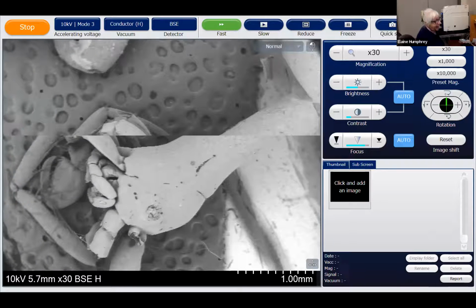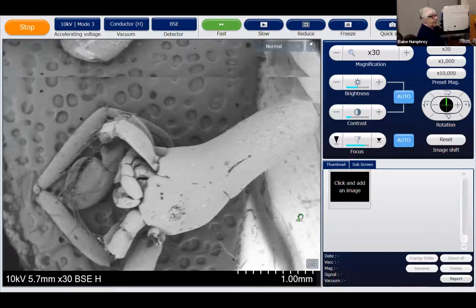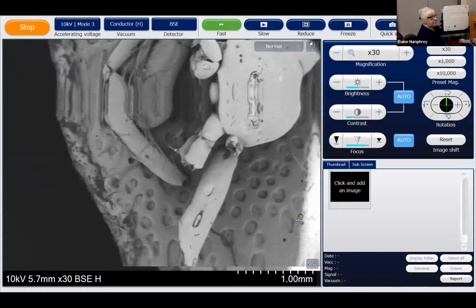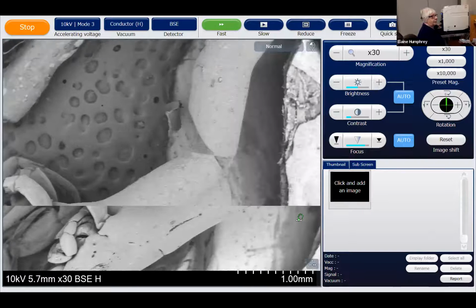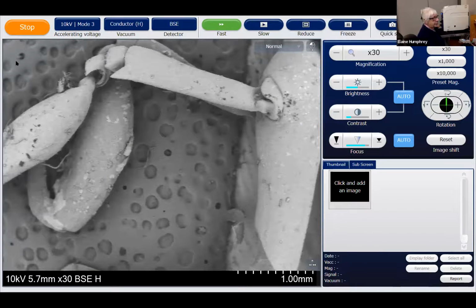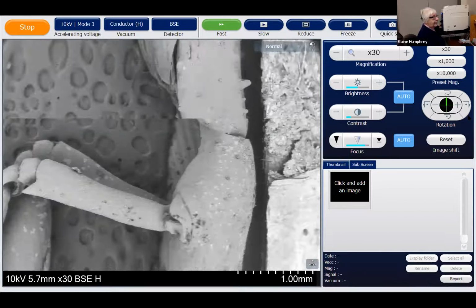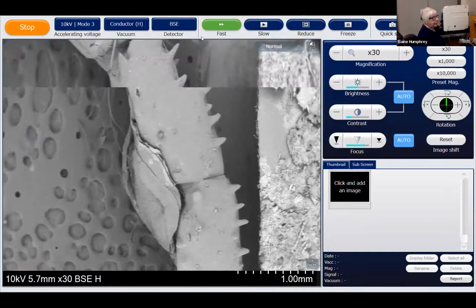So this is the head and its claws and things and its antenna. And so you can see this guy is really big. Whoops, I'm going the wrong way. Let's bring him over. And his front legs have got these claws to catch on to his prey. And then the back end starts to get spiky down his back.